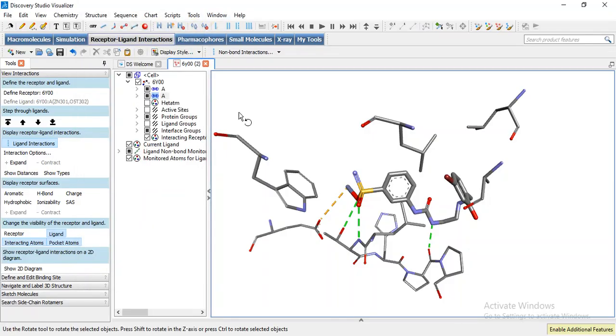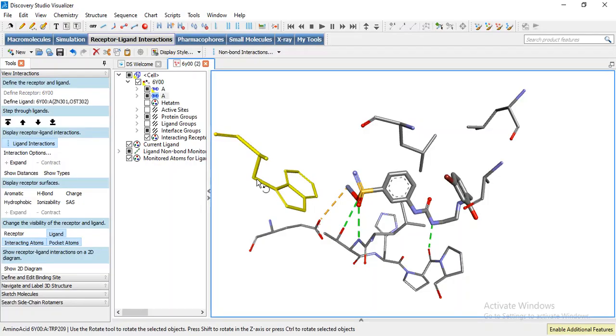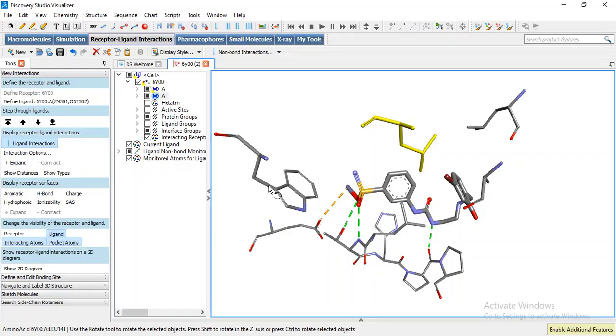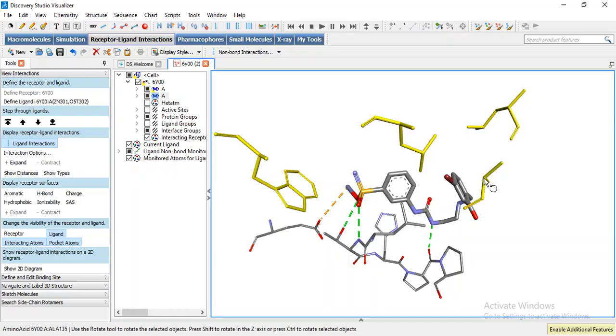Now we can select these residues by control double click. To select all these at a time control shift double click. We are not interested in these, so we can remove this.